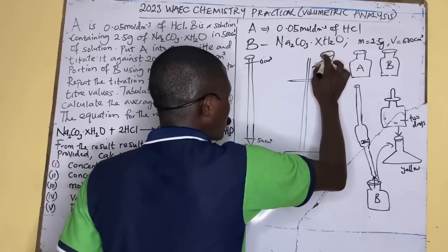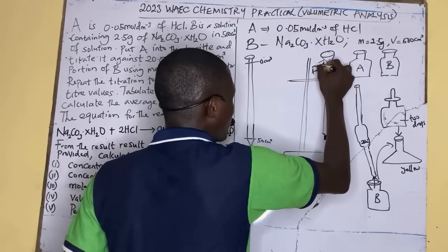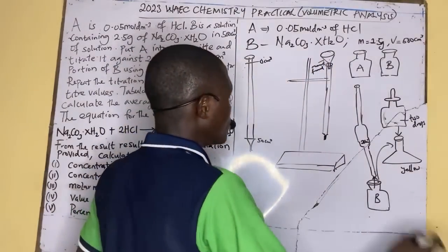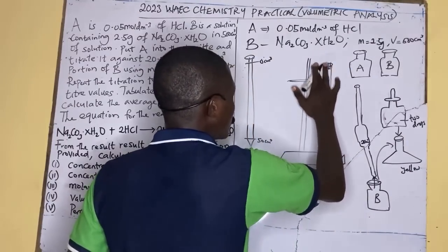Remove the funnel after filling up. So after you have removed the funnel after filling up, you bring it out. Let me clean it. So after I've removed it like that.